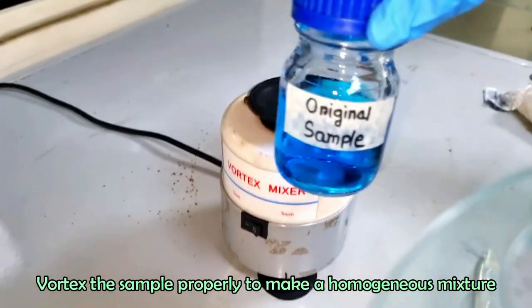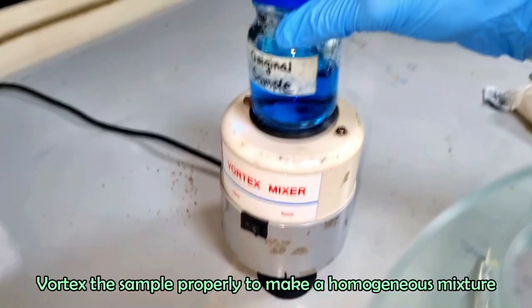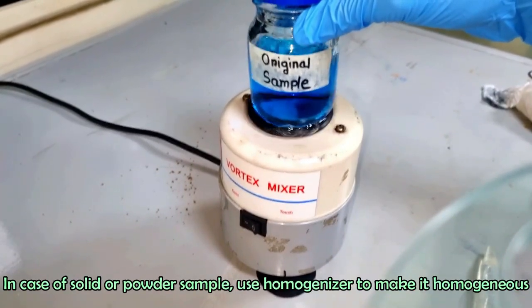Before going for the serial dilution, vortex the sample properly to make a homogeneous mixture. This mixing is very crucial to get accurate test results by the serial dilution technique.